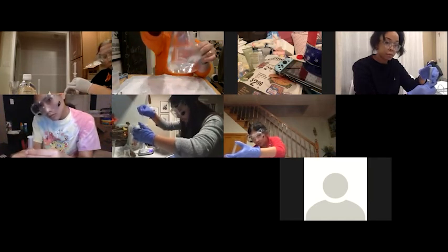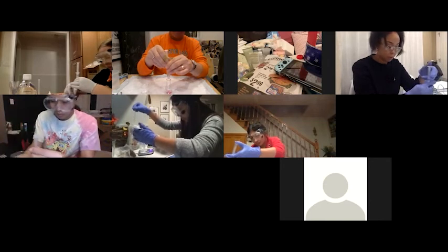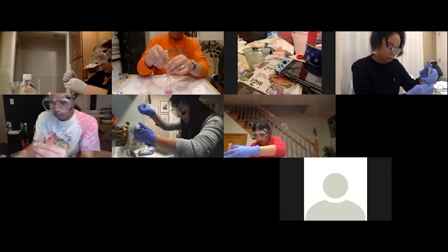Yeah, here you can see it gets really pink, and then just like magic, disappears. So you can see you can add it just pushing very gently from the base. You can get basically a drop at a time.